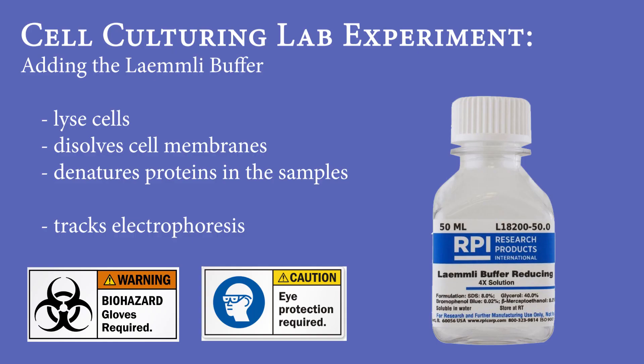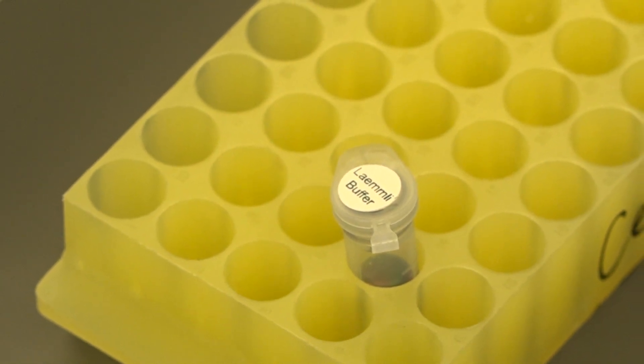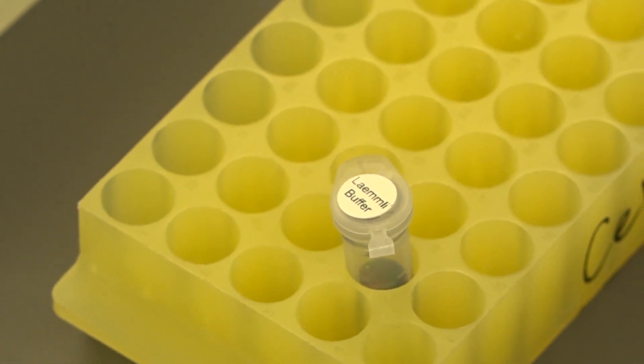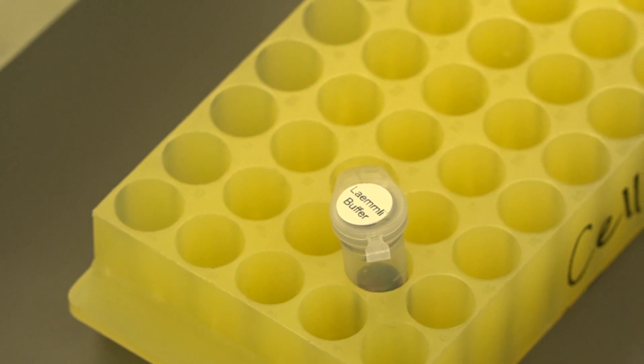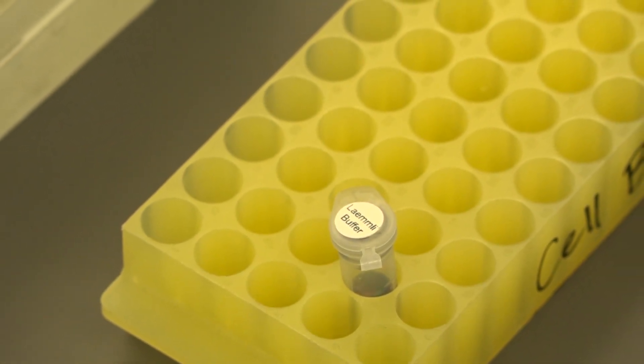The final step of processing your cells is to lyse the cells in a sample buffer called Laemmli buffer. This buffer contains the detergent SDS that can dissolve the cell membrane and denature the proteins in your samples. It also contains the bromophenol blue, a blue dye that is used to track the progress of electrophoresis, which you will perform later in this lab.